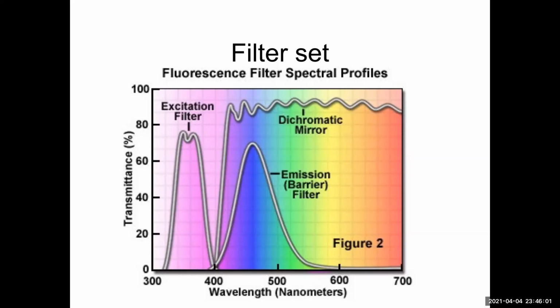And then on the other axis, the y-axis, you have how much of the light of that color is transmitted. So percent transmittance. This is a feature you're just stuck with, and pretty much most of the filter sets are around 80-ish or so, any good filter set. And it's just good for you to know that nothing's 100%. It's not heaven. This is real life.